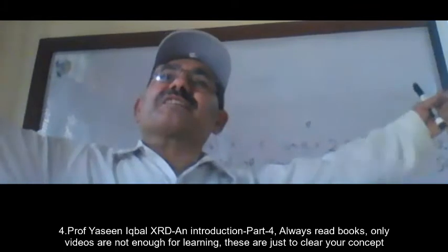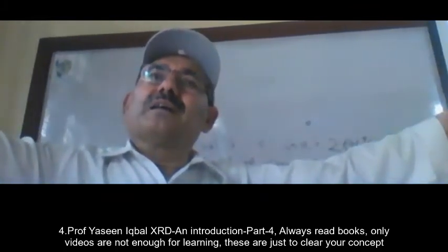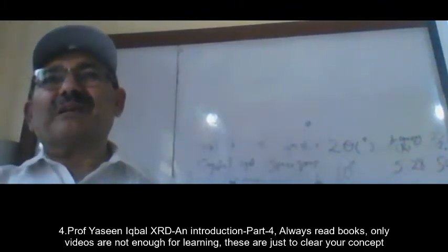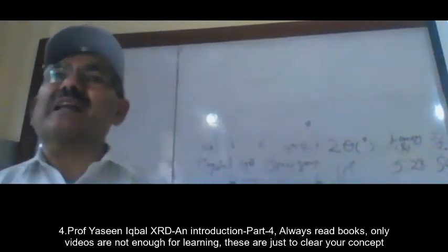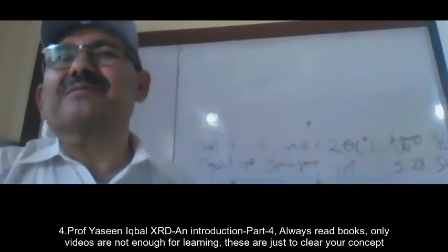When the dimensions are too large, because organic compounds have very long molecules, ligands and complicated structures, they come toward the smaller angle. Why? Why not a larger, higher angle?